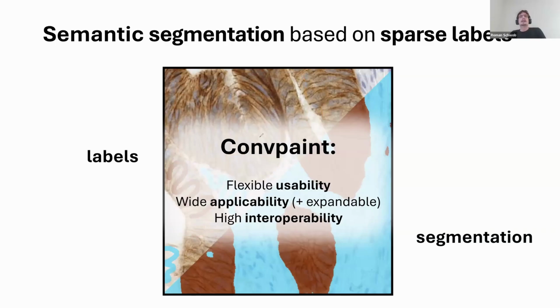Yeah. And I'll tell you a little bit about what makes Convpaint, at least from my point of view, special and what's unique about it. As you'll hopefully see, Convpaint is very flexible in its usability. You can use it on a lot of different data. We have implemented a lot of options and features in the tool.